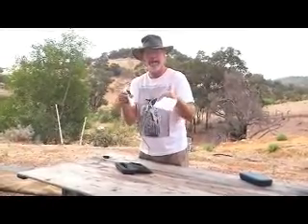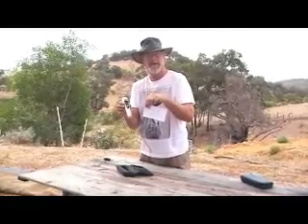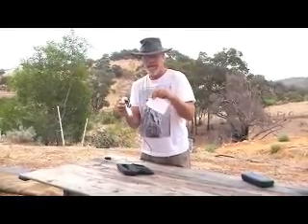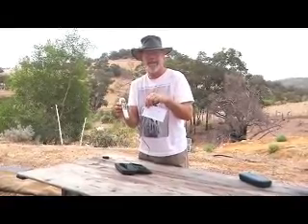In the packet here, you have a manual, and it's got all calibration specifications in there, how to do it, what to do. And actually, if you need any more information, if you go on Google, you can just find out how to make a solution to calibrate it yourself.